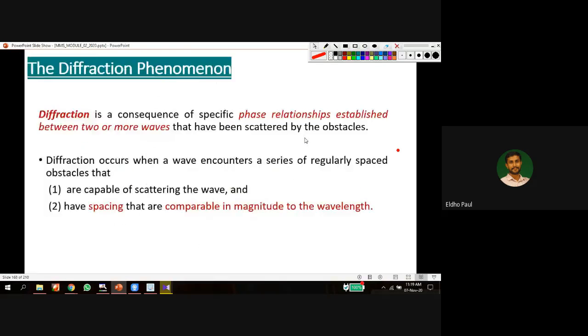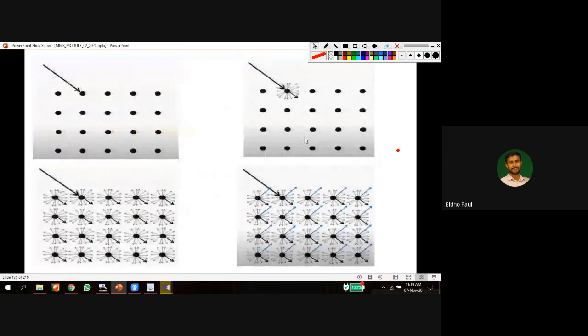When you come to the microstructure, what happens to this beam? So this is the incident beam. Inside the sample, this is the arrangement of atoms or particles. What happens to this incident beam when it is incident on this particle? I am taking only this particle. Actually this beam is incident on all particles, but I am taking only this single particle.